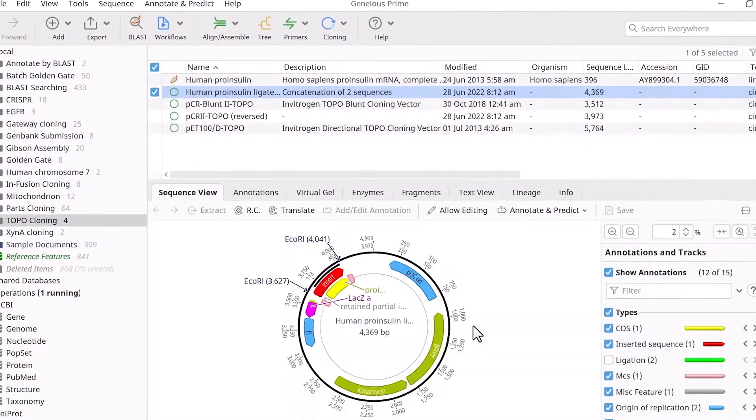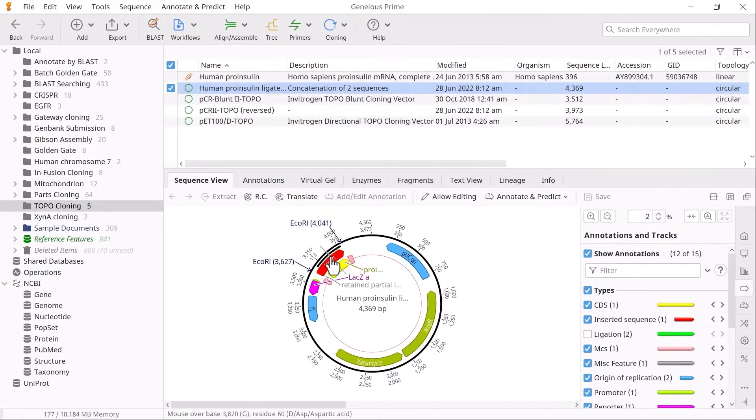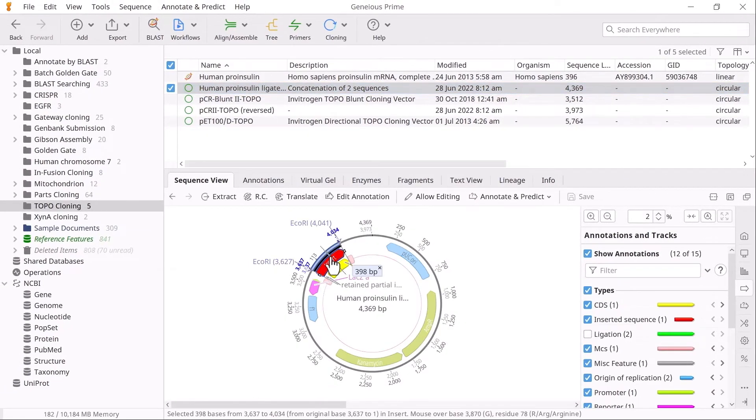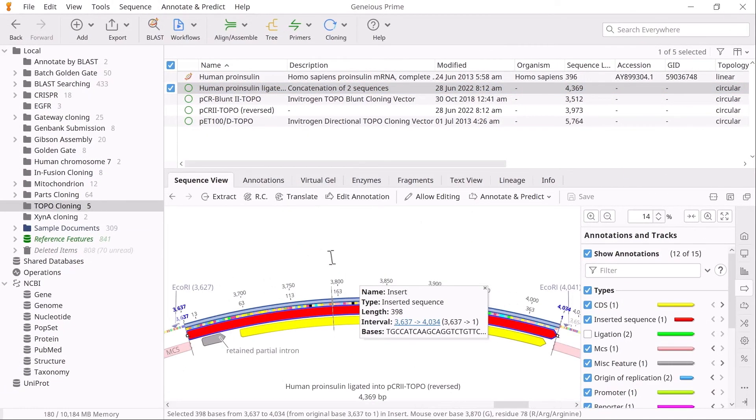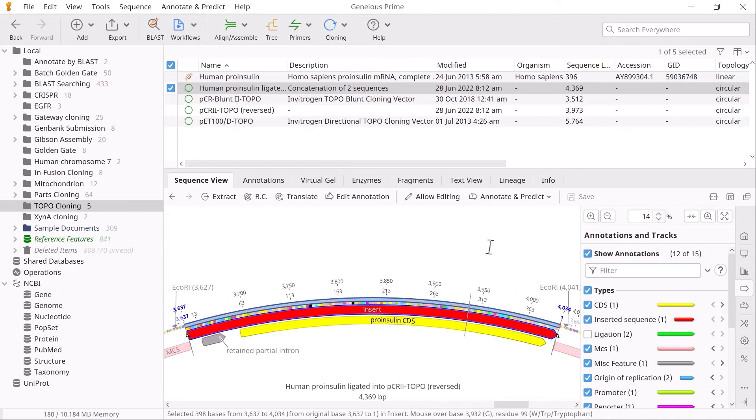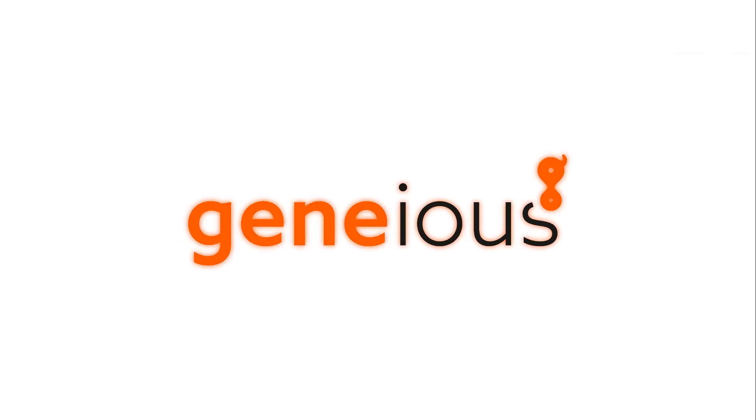The resulting product sequence displays the inserted sequence as a red annotation. And that's how to perform Topo TA cloning with Genius Prime. To learn more, visit Genius.com.